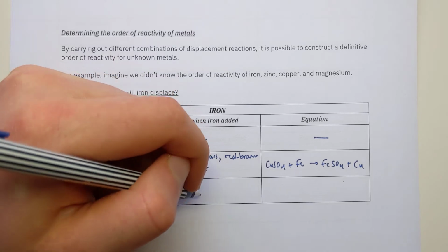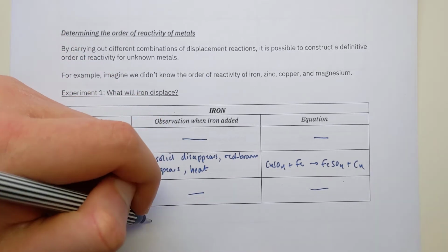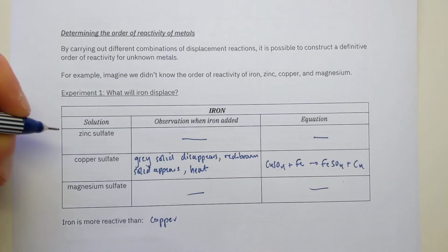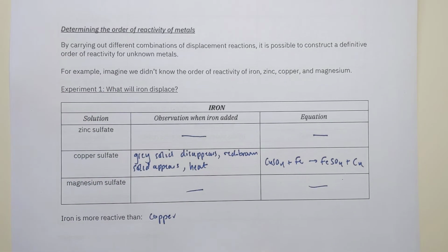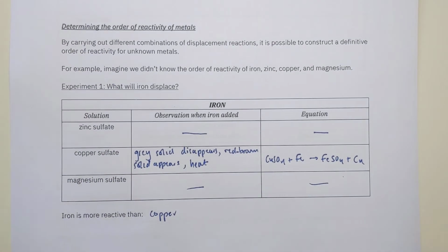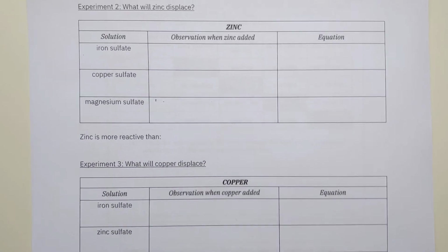If I add iron to magnesium sulfate, nothing happens. So from that information I can tell iron is more reactive than copper because it did a displacement reaction, but less reactive than zinc, wasn't able to displace it, less reactive than magnesium, wasn't able to displace it. So it gives me a bit of information, but I haven't got the full picture yet, and need to do some other combinations. So let's say I look at zinc now.